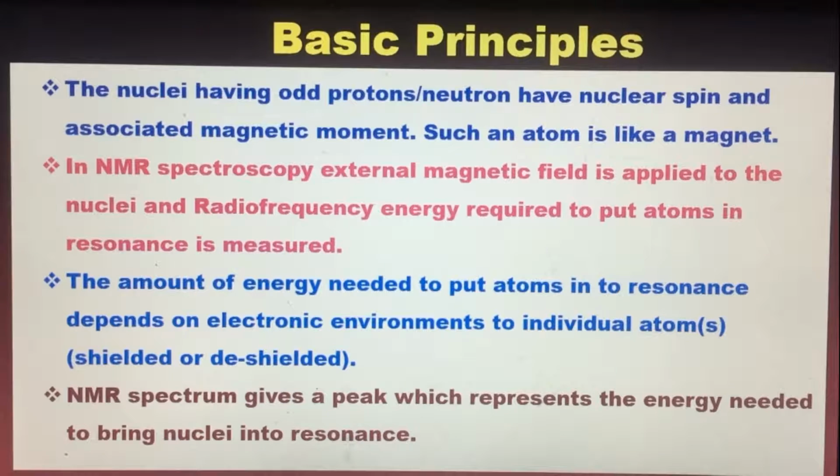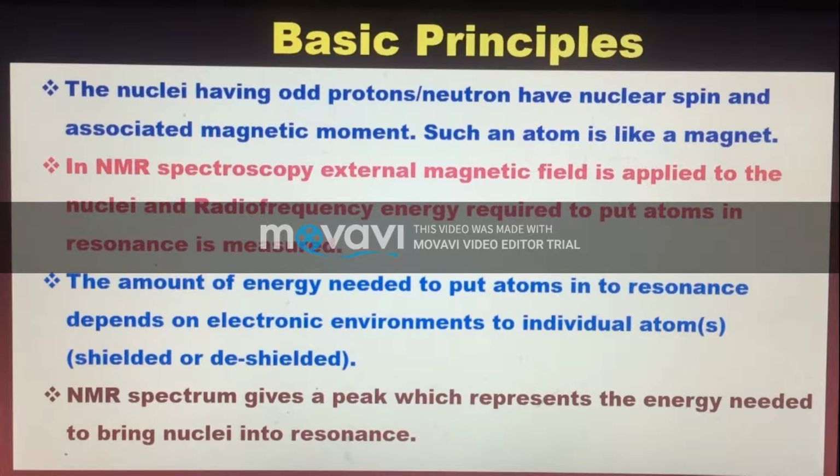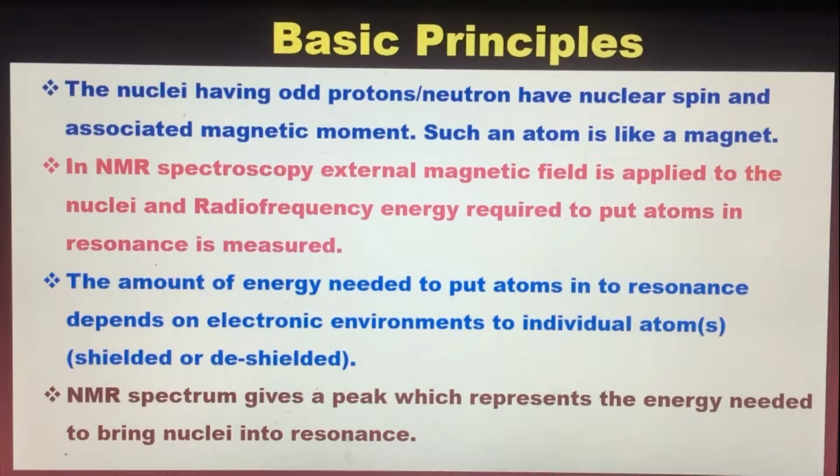That is, we will measure the radio frequency energy required to bring nuclei into resonance. Okay, clear?